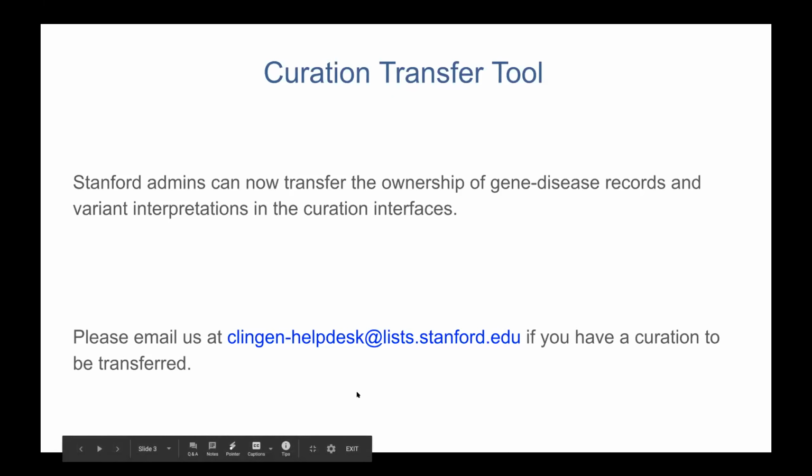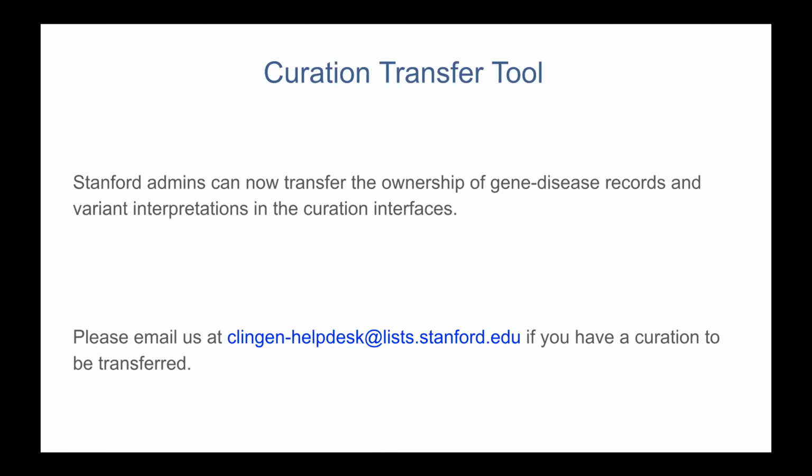One of the major use cases for this is there's a number of groups that started curating before we started putting together affiliations, and so there may be curations in individuals' dashboards that need to be moved into an affiliations dashboard. But in any case, if you have a use case for this, please let us know and we'll be happy to help you out for the transfer tool.